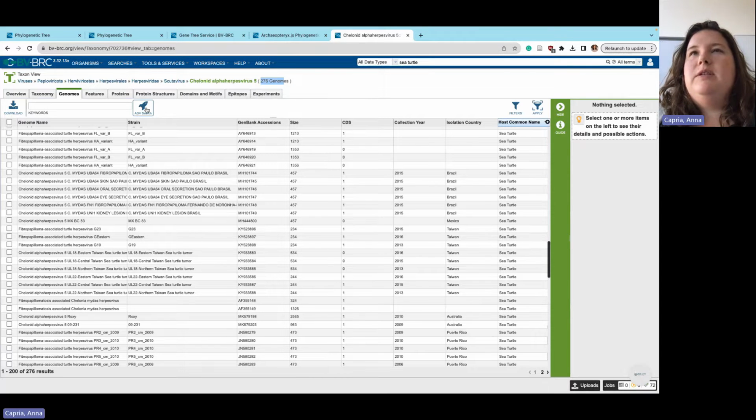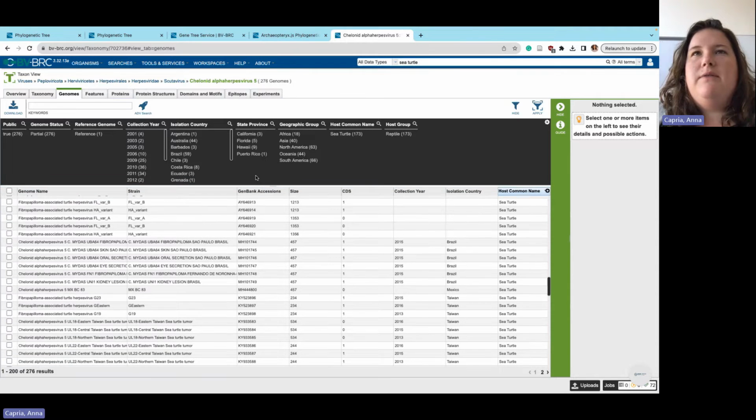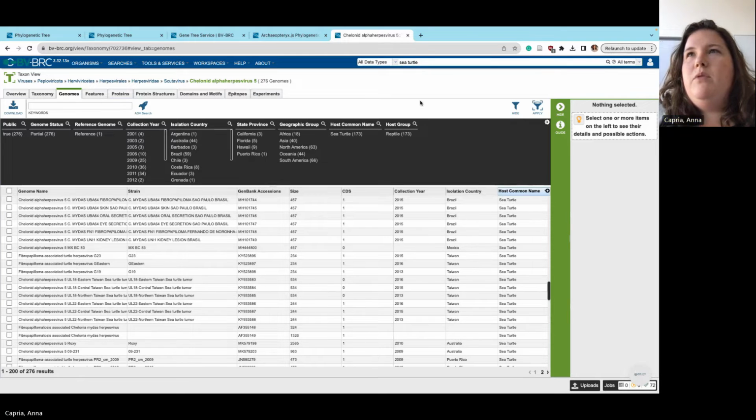You might be interested in further refining your data with filters. This is all something that we went through over in the first workshop, so once that's posted, I highly recommend looking at that further. But I made a genome group with these genomes.